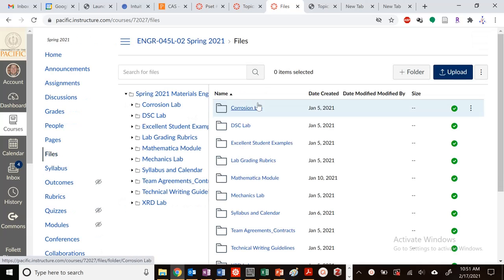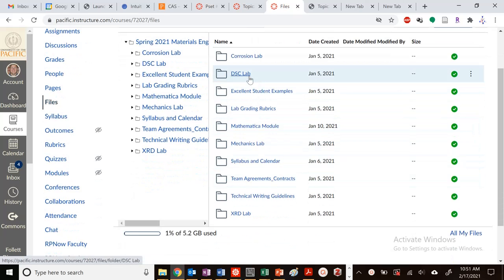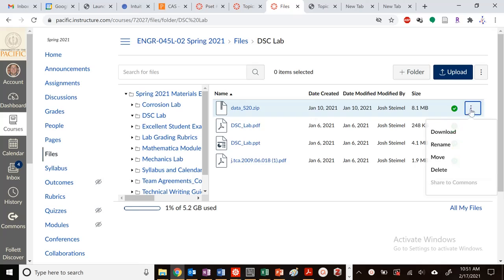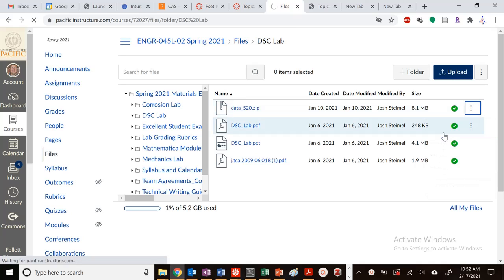Hi everyone, we are back, and so we've basically watched the video from our lab handout on DSC. We looked at how the experiment was performed, and now let's get into our data analysis. So let's look at the data that we have available, and let's figure out how we're going to perform this experiment.